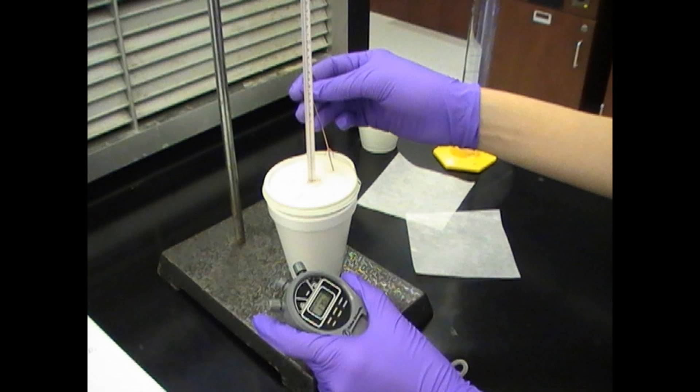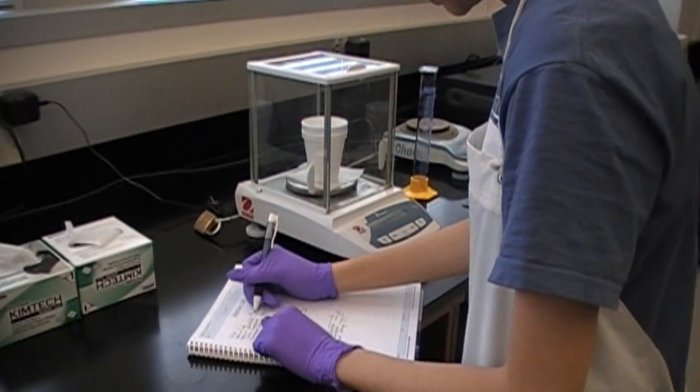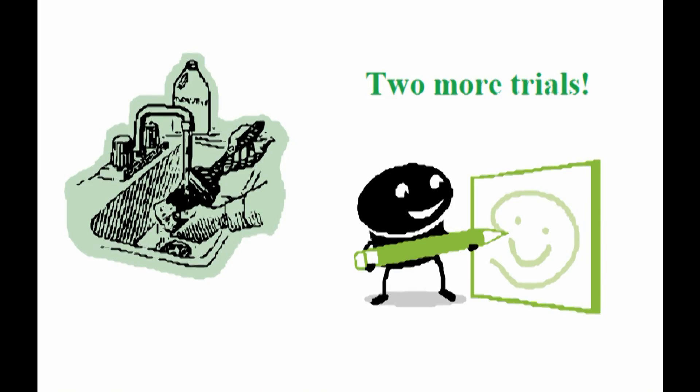Once the reaction is completely finished, remove the lid, stirrer, and thermometer, and record the weight of your dry calorimeter with the solution at the balance station. Now thoroughly clean your calorimeter, and conduct your next two trials.